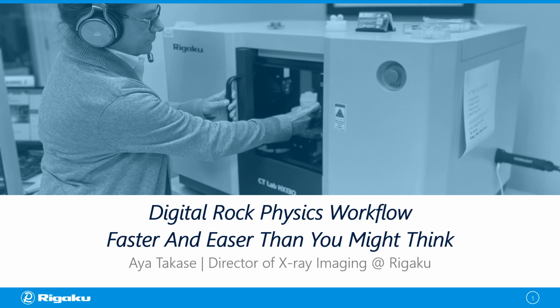In this presentation, I'm going to give you an overview of digital rock physics workflow, and I hope to show you that it is faster and easier than you might think.